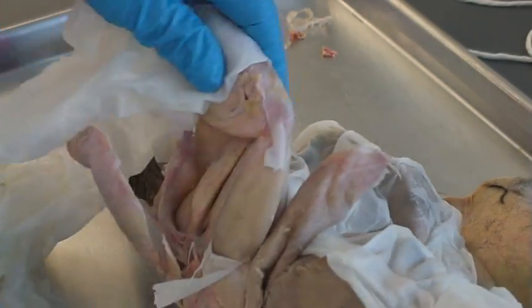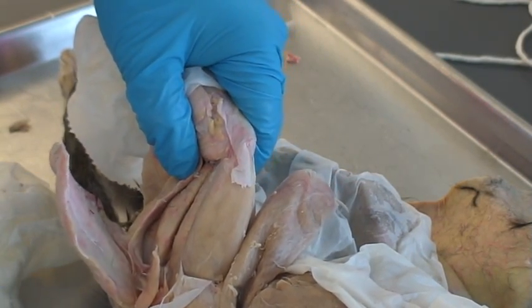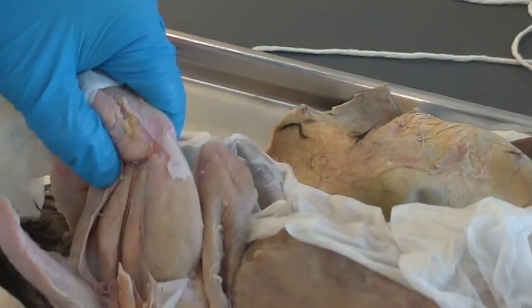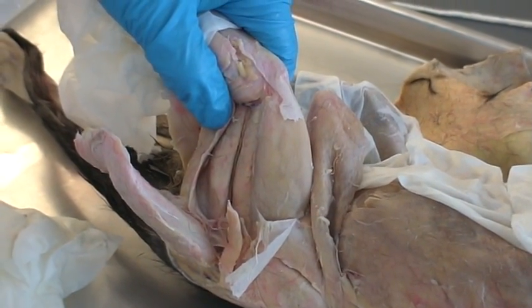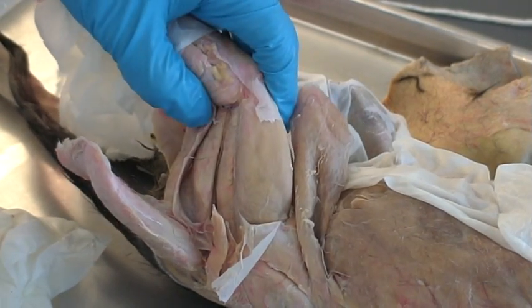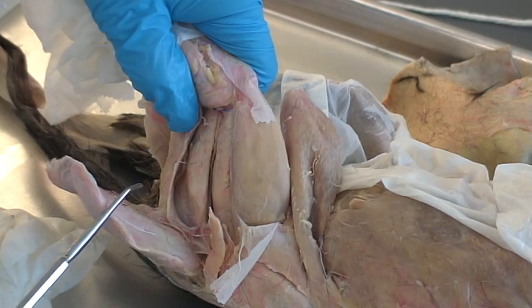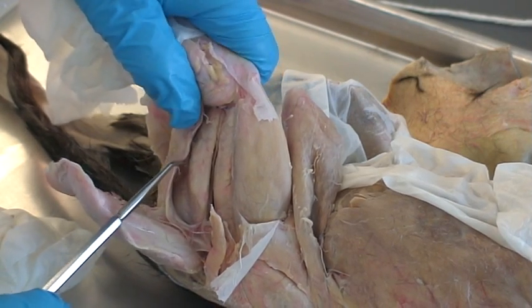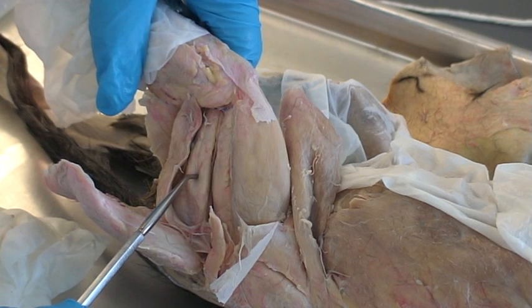Now if you turn the cat over to the side of the thigh, you see two muscles right here. The first muscle is your semitendinosus, and the next muscle is your semimembranosus.